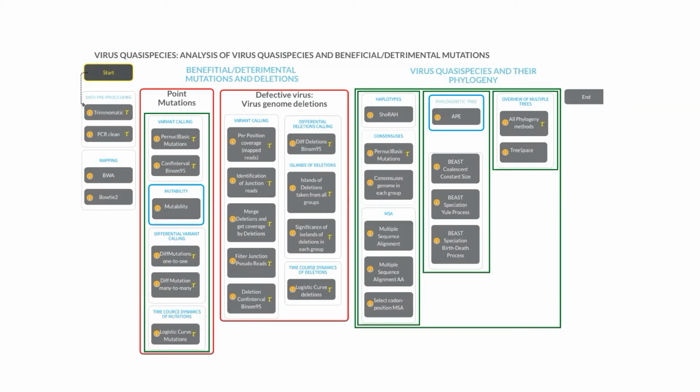Then we reviewed this new section that tries to combine several different important types of analysis that are going to be useful for the types of things that we do. So what are those different things? We have an ability to map our sequence reads from next generation sequencing FASTQ files, align them to a genome, pre-process them, clean them.